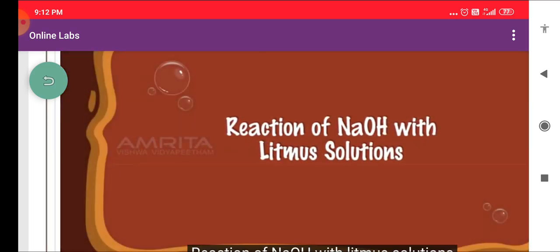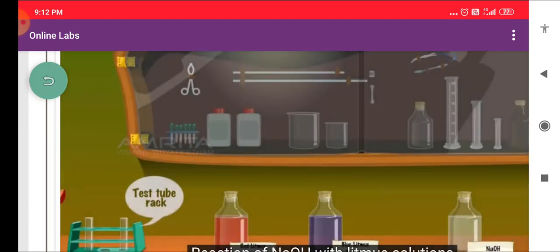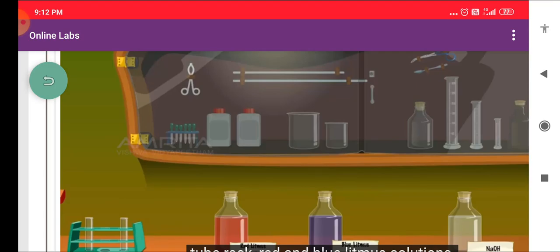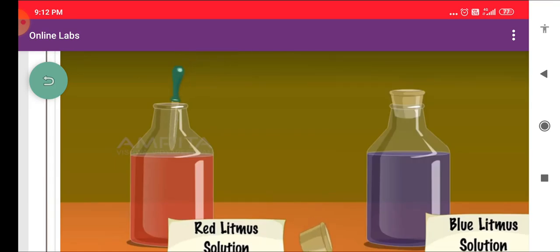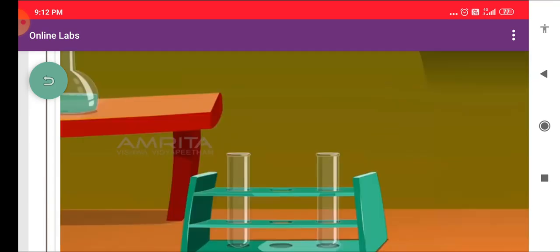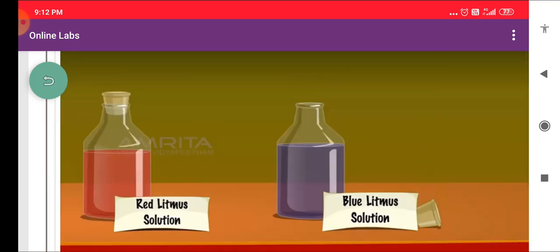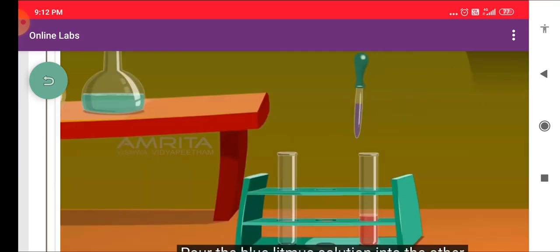Reaction of NaOH with Litmus Solutions. We require two test tubes placed in a test tube rack, Red and Blue Litmus Solutions, NaOH Solution, and a dropper. Take the Red Litmus Solution and pour it into a test tube. Take the Blue Litmus Solution and pour it into the other test tube.